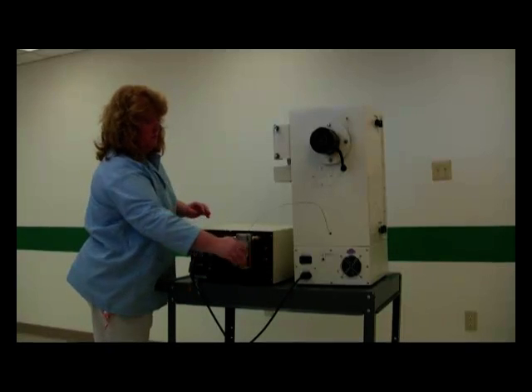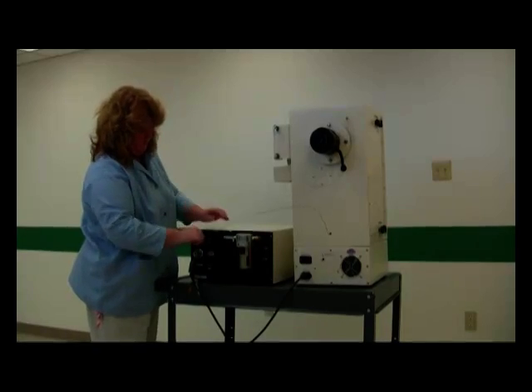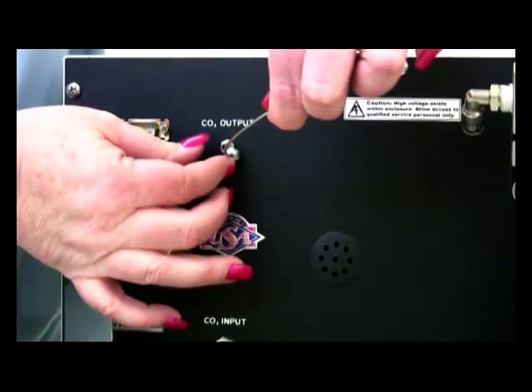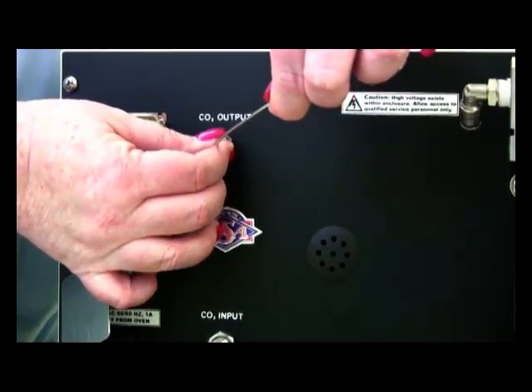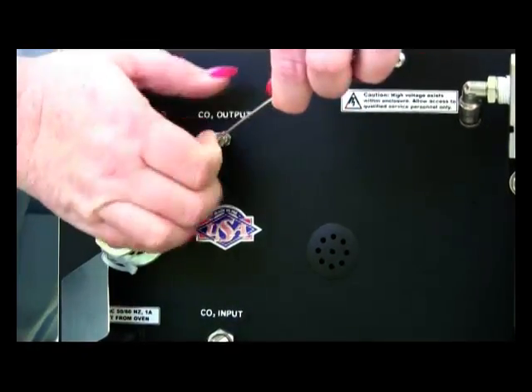Next, take the CO2 line that comes from the back of the oven and connect it to the CO2 output. Use a 5-16 inch wrench to tighten it to prevent leaks.